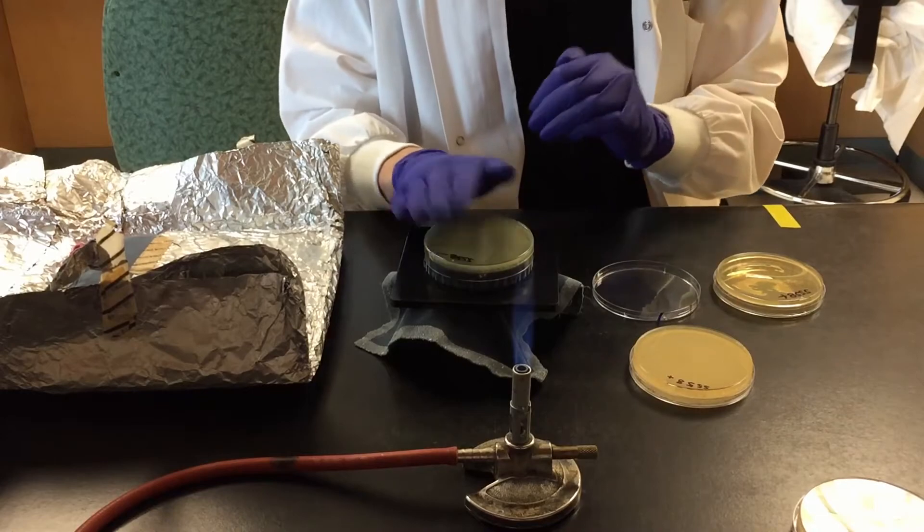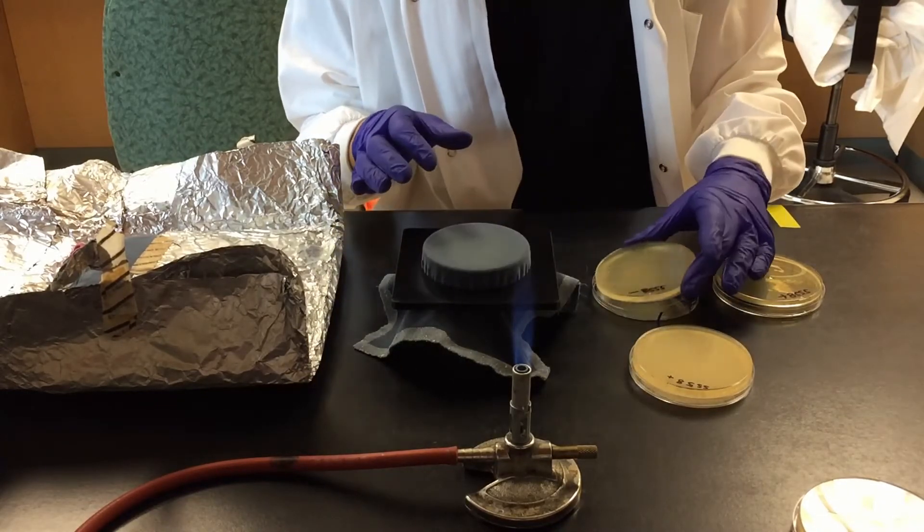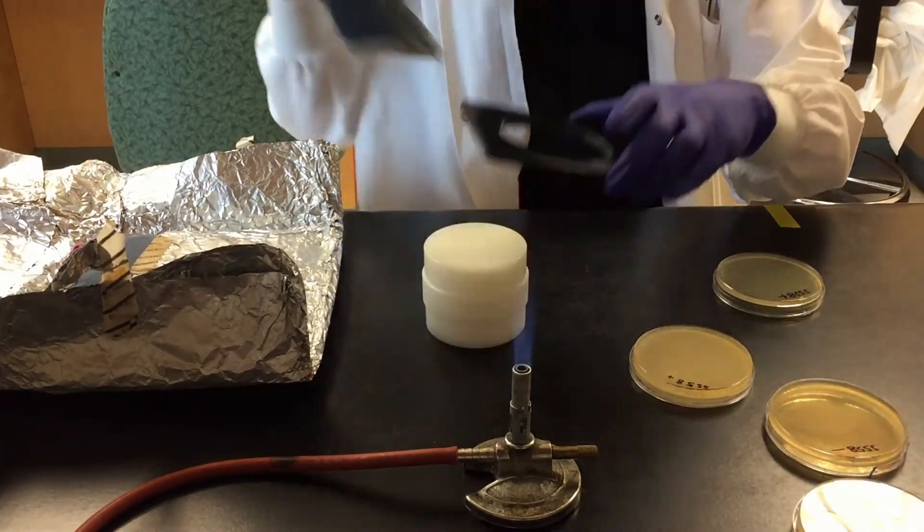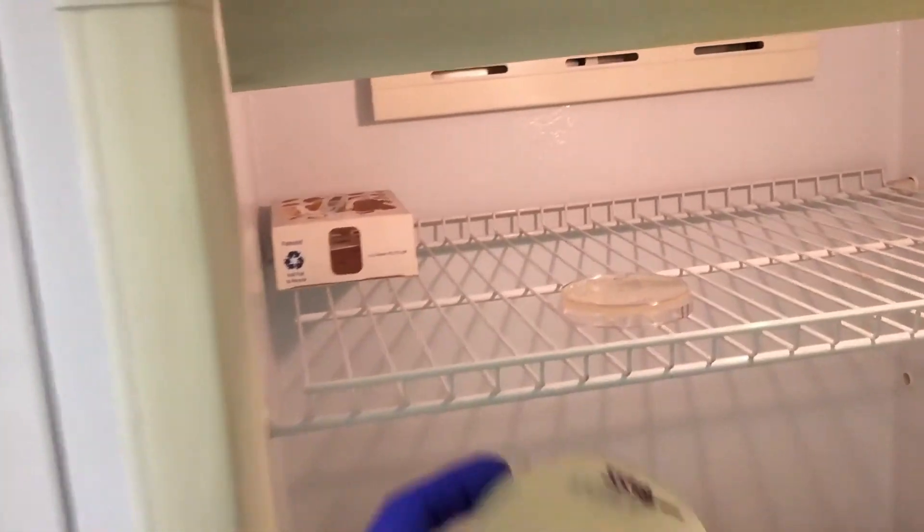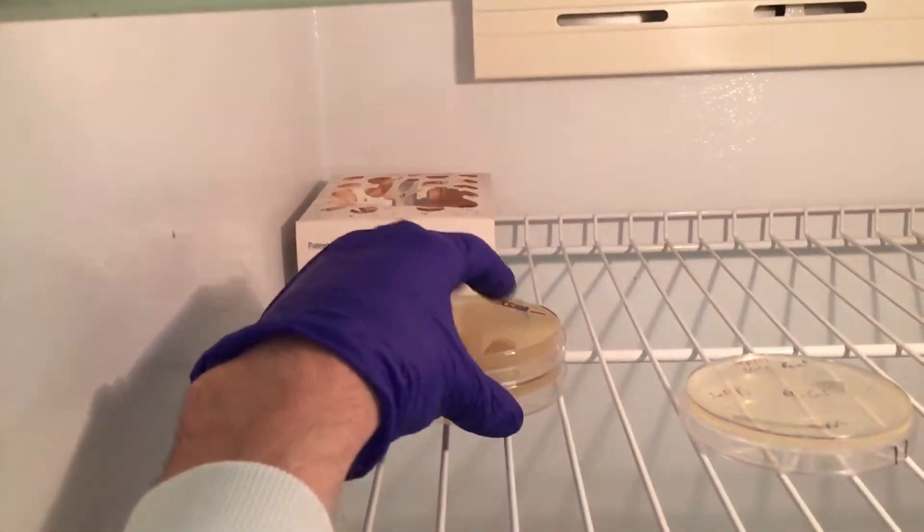Lightly press the new selection plate onto the cell covered felt. Incubate the new selection plates at 30 degrees for 1 to 2 days.